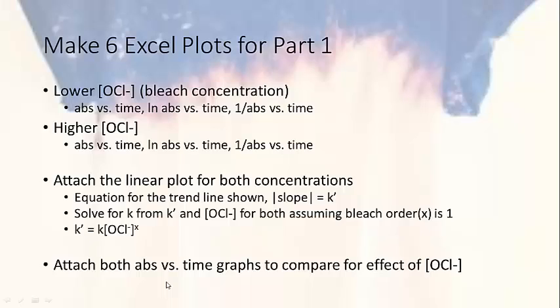You'll also attach the absorbance versus time graphs to compare them for whether the bleach concentration has an effect. We're telling you that it's 1, okay? So we're telling you that it does have an effect, but you should be able to look at the absorbance versus time graphs and look at those slopes and the progression of the reaction and, you know, circle the areas on the graph and say, yes, there is an effect because, and then explain it, how you can figure that out from the graphs and attach those to your report.